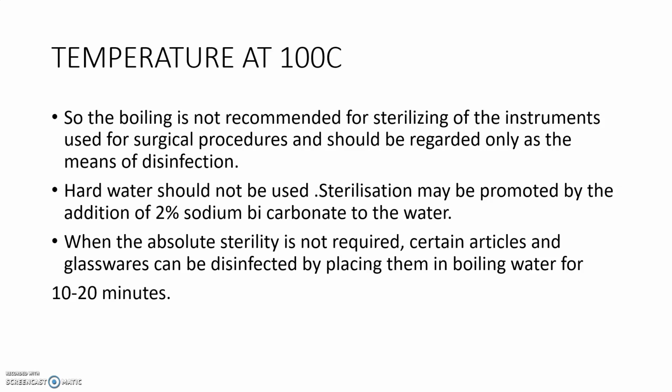And also in this boiling procedure, hard water should not be used. When hard water is used, the effective boiling technique doesn't take place. So we can promote the sterilization by the addition of 2% sodium bicarbonate to the water to convert this hard water.